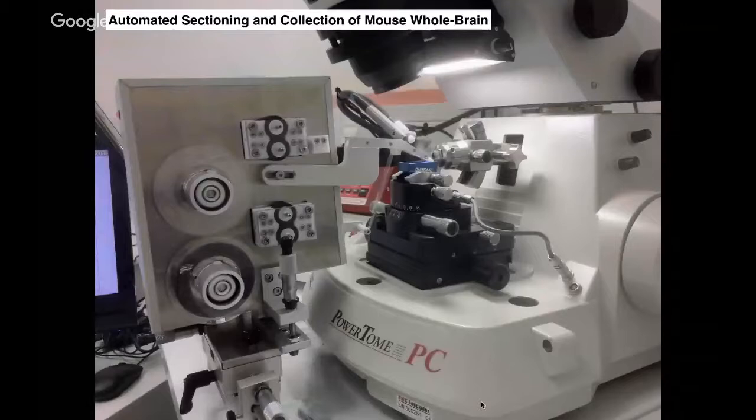And so I purchased one of these ATUMtome machines. So this ATUMtome is this box on the left-hand side. This was based on a design that Ken Hayworth developed some years back in Jeff Lichtman's group at Harvard. And they've been developing this technique extensively. What it is, basically, is a conveyor belt for picking up sections that are produced automatically from a commercial ultramicrotome, which is shown on the right-hand side.